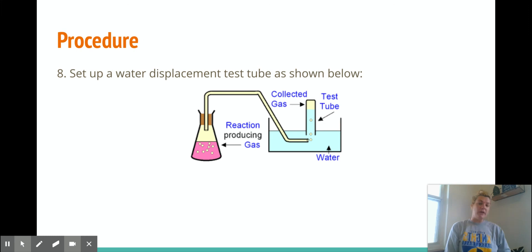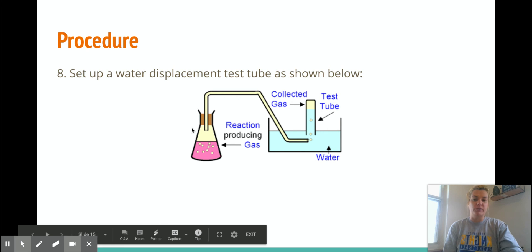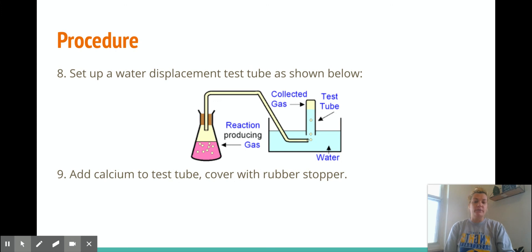The second part of the procedure is calcium. So the first thing that you're going to see is a water displacement test tube as shown before. So what's going to happen here is we're going to react the calcium with water here, and the gas that forms is going to go up through this tube into the water. And what's going to happen is the gas is going to go up and push water out, and you'll start to see them separate. And what is in the test tube is the gas that's actually being produced over here. And then we're going to add calcium to the test tube, cover with a rubber stopper, and then record observations.